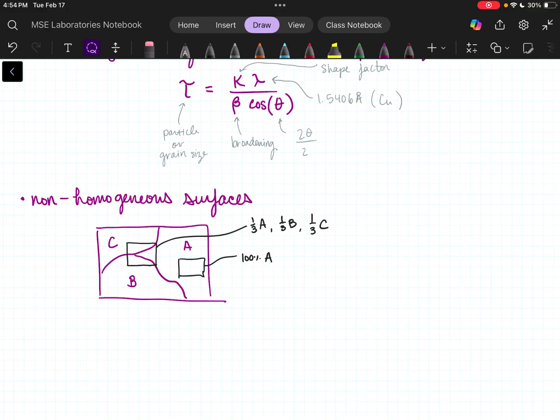There are place-specific X-rays that can tell you X-ray at this position and at this position and at this position. So related sort of to microscopy. Okay. Gold standard would be crush up the sample. Basically just get the sample as homogeneous as possible. There's only so much we can do.